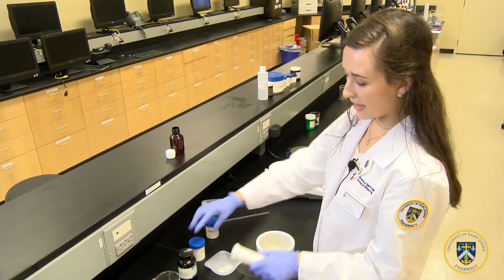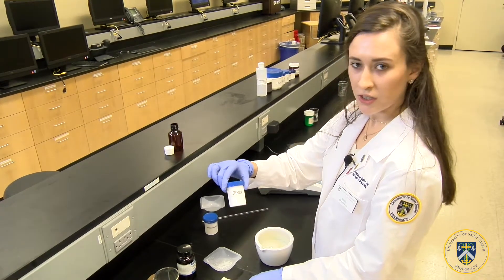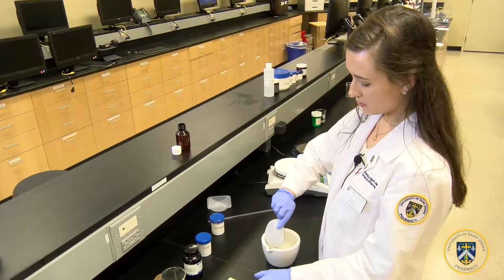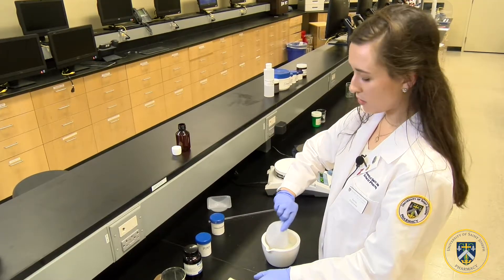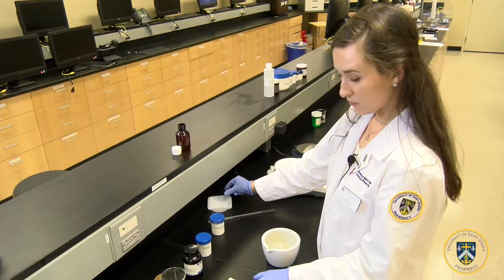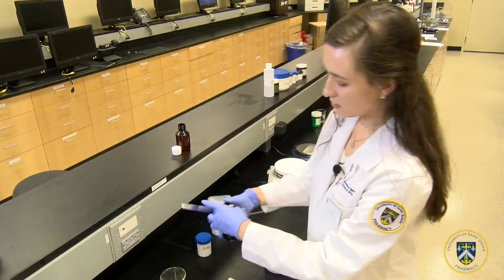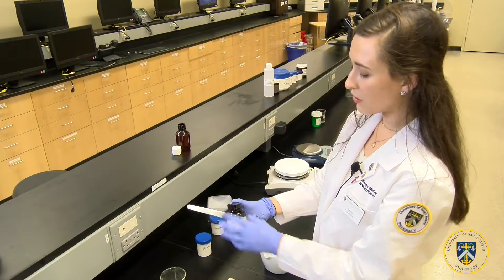Next we will be adding our artificial sweetener Splenda, also to the mortar — about 100 milligrams of it — and then a few scoops of our blue food coloring.